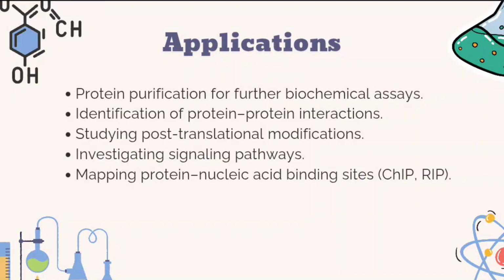So we can say it is used to study protein purification, to identify protein-protein interaction, to study post-translational modification, investigating signaling pathways, and mapping protein-nucleic acid binding sites with the help of ChIP or RIP.